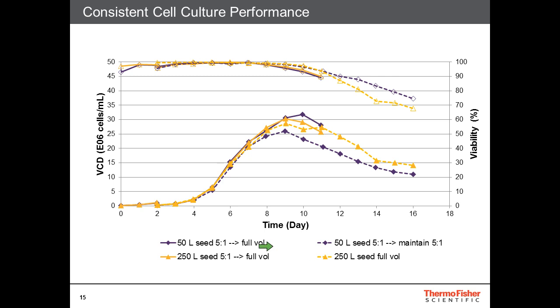And when you look at this graph, which is most important in this session, you have the viable cell graphs against time at full volume as well as at 20% volume. So that means when you run at 20%, the bioreactor behaves as much as a 100% culture. There is no difference in performance between the 20%, as you can see in these dotted line graphs, and the solid line, which are the 100% process runs. In the same way, when you look at the viability, there is no compromise on the viability of the cells.